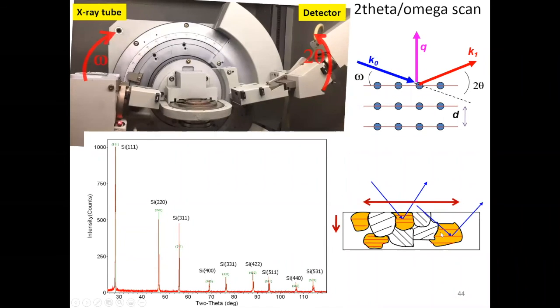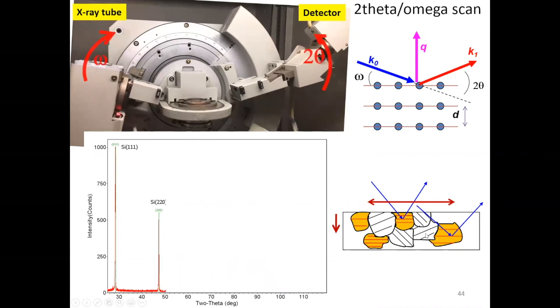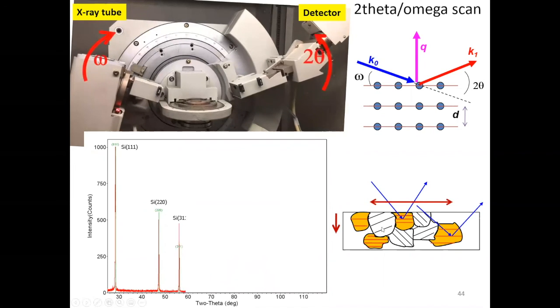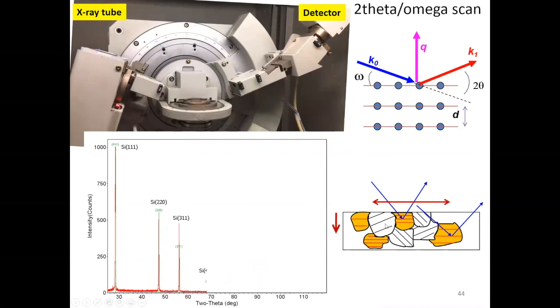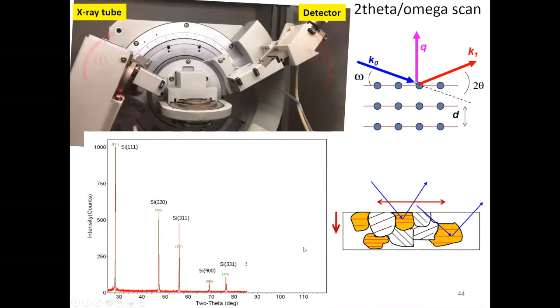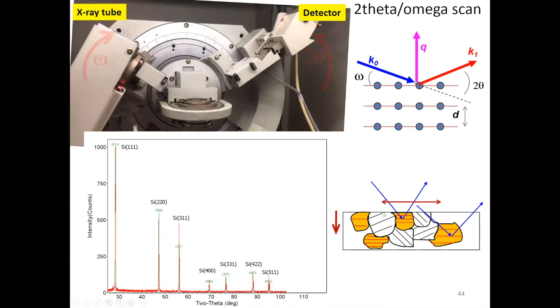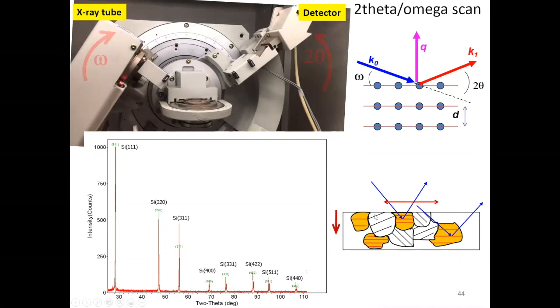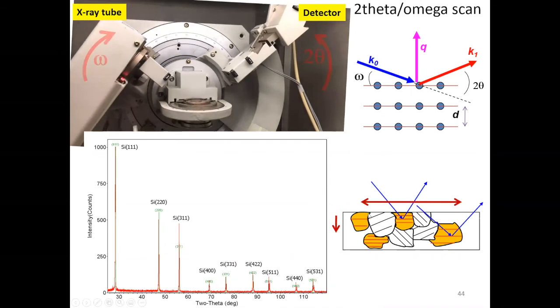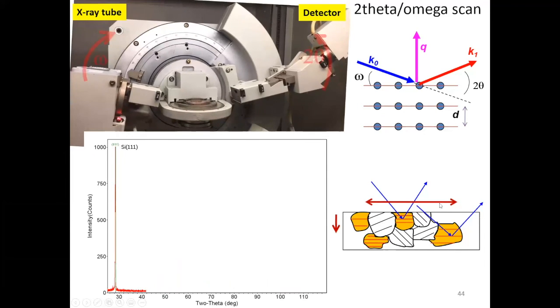Another important thing to see here is that as the incident beam angle increases, notice that the footprint of the beam, the area on the surface, is going down. It's actually becoming narrower, but you go deeper. So if you set up your instrument properly so that you always have sample inside the cavity of the detector, you're always collecting from the material. Keep this in mind for future reference, and we go from that.